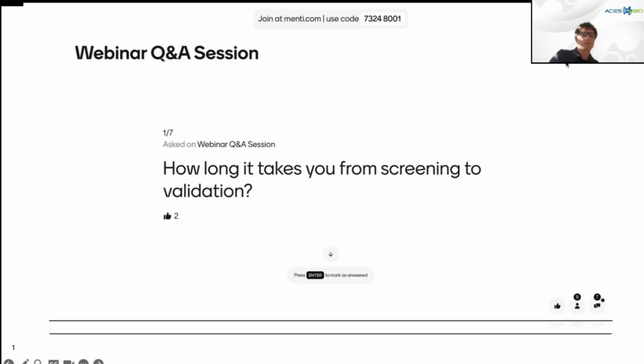Yeah. Sure. So, of course, every project starts with a setup where we need to set up all our methods, including analytics, cultivation techniques. So we always have, let's say, a month usually reserved just to set this up. But as we begin our improvement, let's say that just to define at least one round, because we never know how many we will do based on the success.